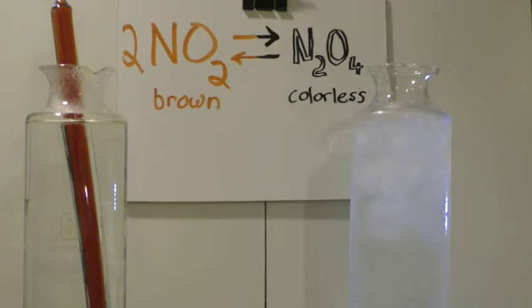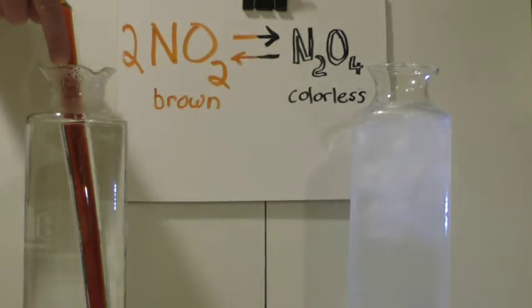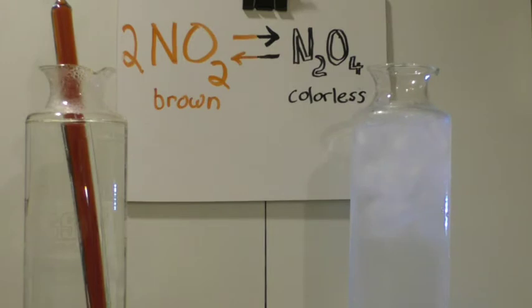So I'd like to show you an example of what's known as a reversible reaction and introduce the concept of equilibrium. And I'll start by showing you the experimental setup. On your left is a beaker that contains water that's just about at the boiling temperature, about 100 degrees Celsius. And on your right is another beaker that contains ice water at 0 degrees Celsius.